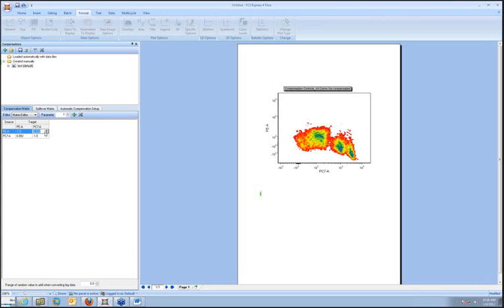But any way you've created a matrix, if I type in 0.5 in here, you can see that the plot updated, and if I type in 0.2 here, you can see that the plot updated right away. Okay, so you can actually adjust any of the matrix coefficients that you want, and it will adjust the plots and the data in real time. Okay? So I'll pause for a moment. Does anyone have any questions about what I've shown so far? Okay, once again, if you have any questions, feel free to type them into the question and answer section at the bottom of your control panel.